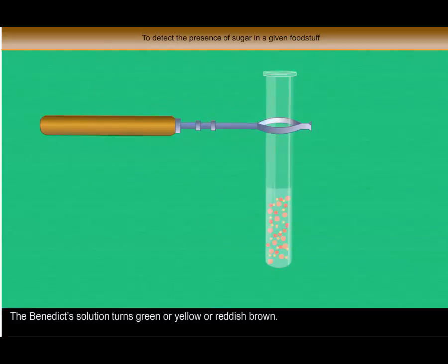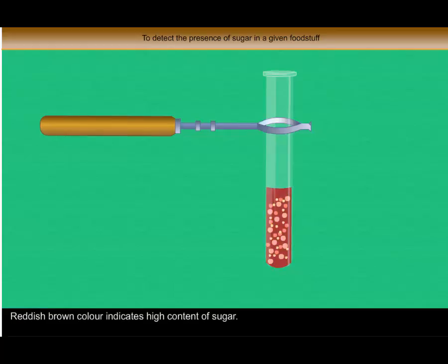The Benedict's solution turns green, yellow, or reddish brown. The colour of the solution indicates the content of sugar present in the given foodstuff. Green colour indicates little content of sugar. Yellow colour indicates medium content of sugar. Reddish brown colour indicates high content of sugar.